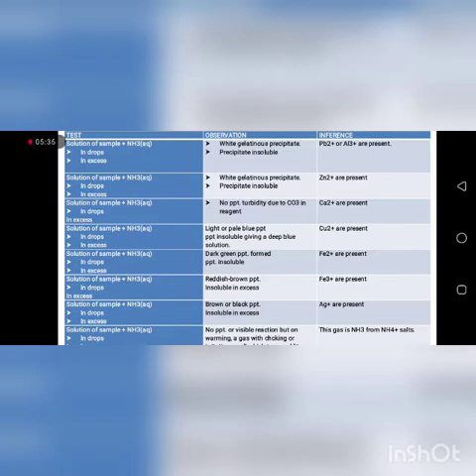So in this, aqueous ammonia is added to the solution of unknown sample in drops, and a white gelatinous precipitate is formed, which is insoluble in excess aqueous ammonia. That confirms that lead or aluminum is present.